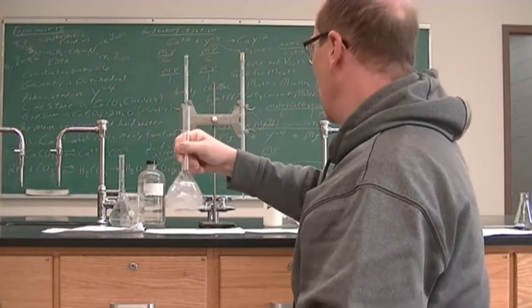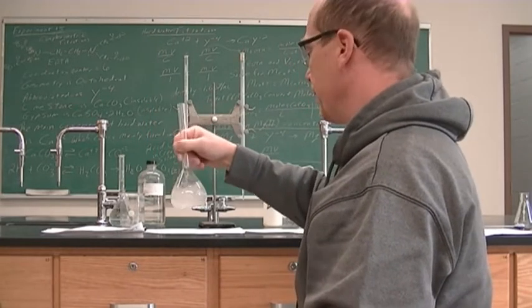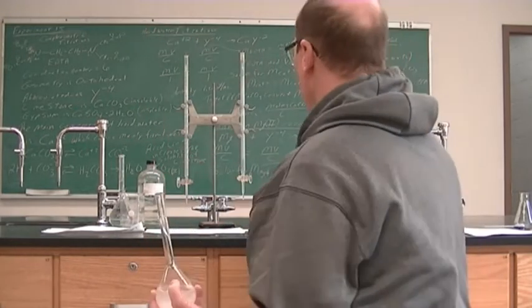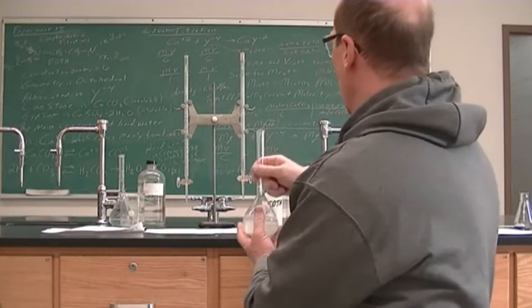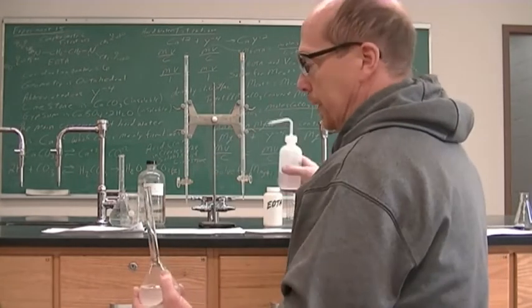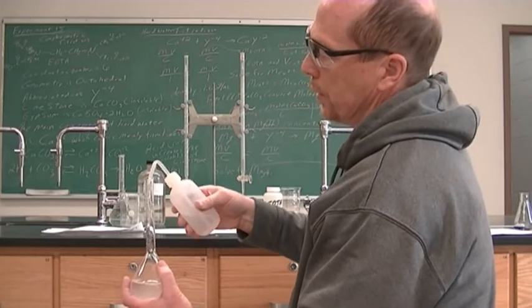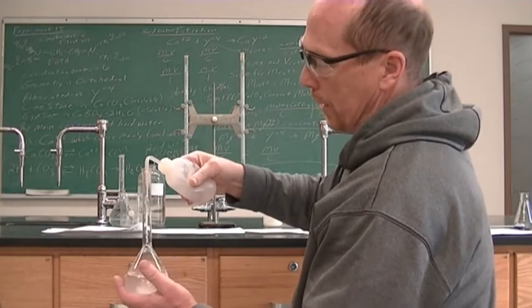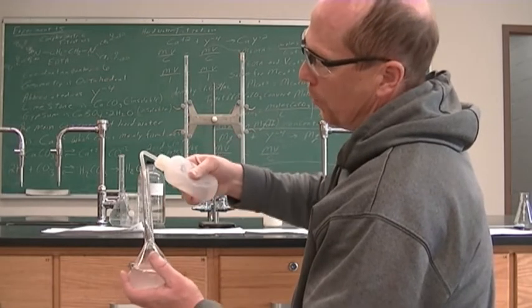And so we're making our EDTA here. We need to dissolve all of our EDTA. And I have a beaker for both the unknown solution and for the EDTA solution. The directions say to get a cork stopper and to shake it up. We are not going to do that.